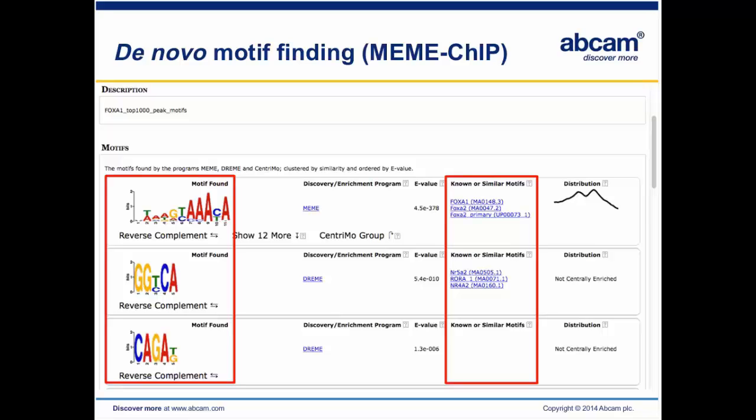There are also some other motifs returned, indicating potential interactions with other transcription factors. And if the family motif of the transcription factor you are ChIPing is not enriched in the binding region, like the FOXA1 negative dataset we are going to show in the next slide, then you need to put a question mark on the data, unless you have other strong evidence suggesting that the experiments are working.